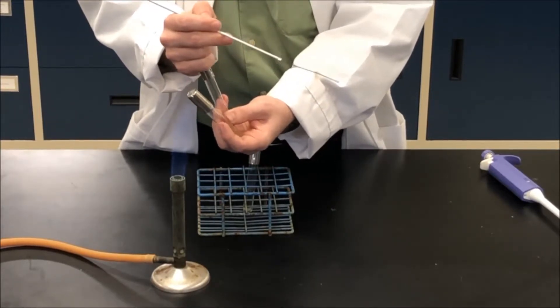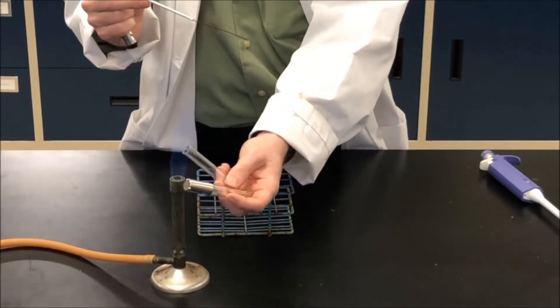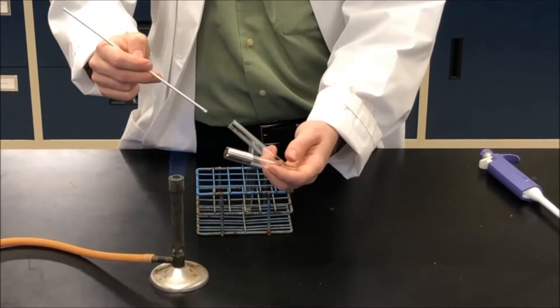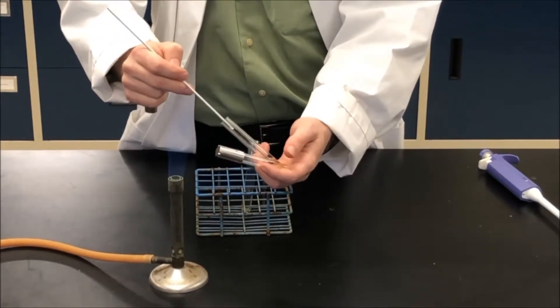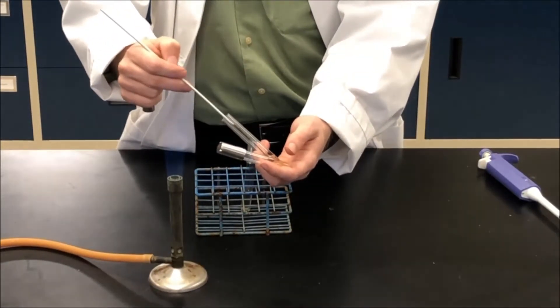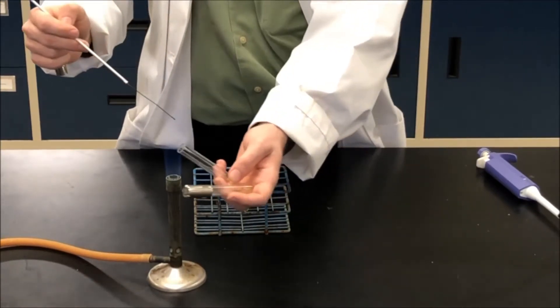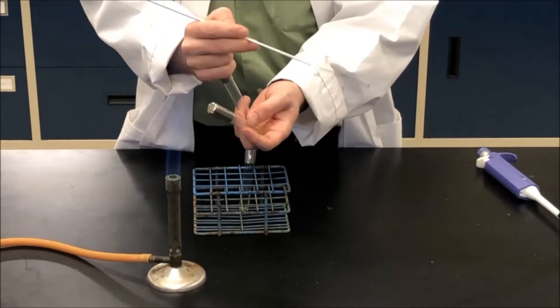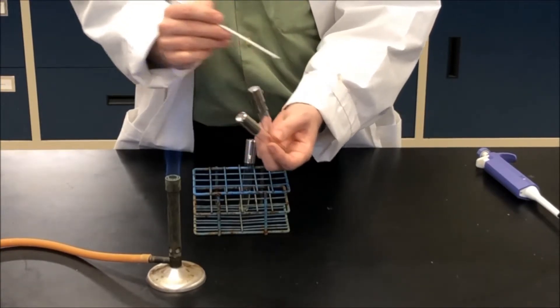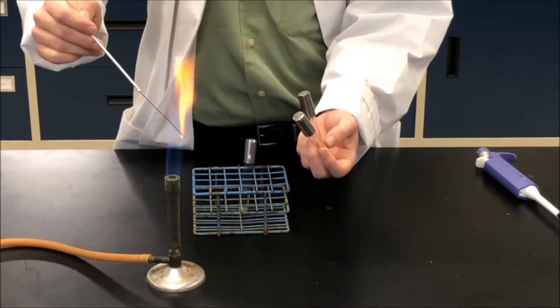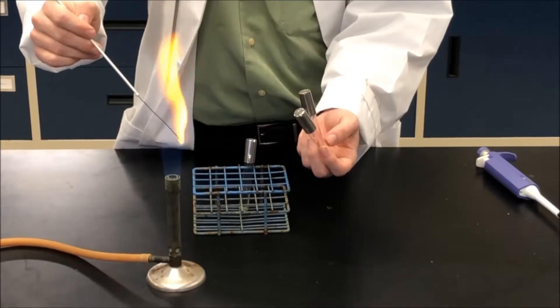After you have some liquid in your loop, you then flame the lip of your culture, close the tube, open up the new tube, flame, and then insert into the new broth. Gently mix, flame, close the lip of the test tube, and then flame your inoculating loop.